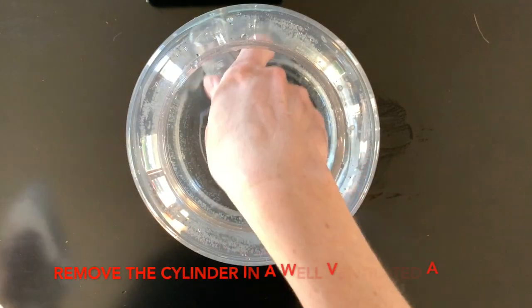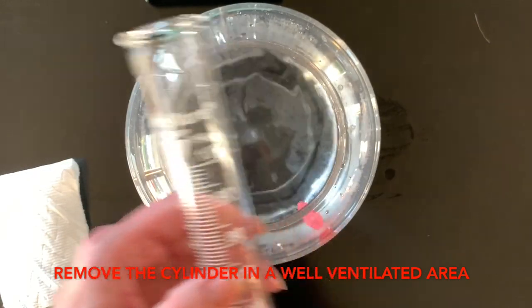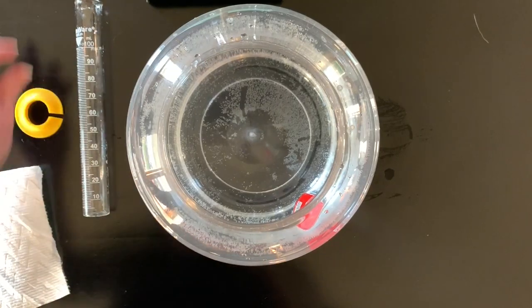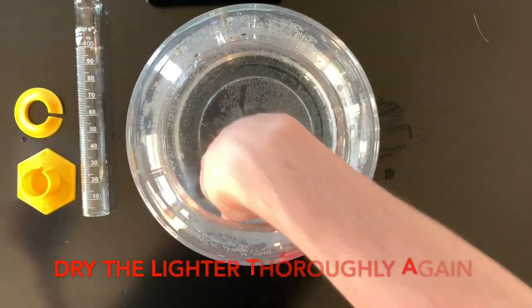Once you've collected your gas from the lighter in a well-ventilated area, remove the grad cylinder and the gas, and then dry the lighter thoroughly just as you did at the beginning of the lab to avoid errors in the mass calculation.